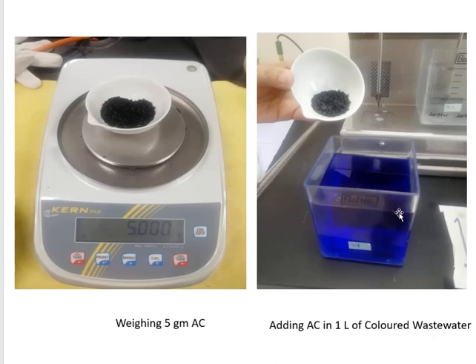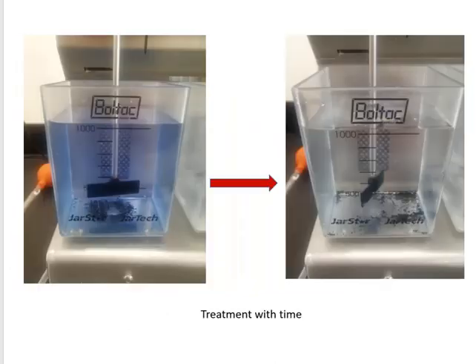We start mixing. Once the mixing is going on, you will see the color will reduce with time. The activated carbon is mixing with the solution from which we need to remove the color. And after some certain time, for example after 5 minutes, 10 minutes, you will collect the sample and you will see with time the color is decreasing. Ultimately you will see that all the color is removed. So this is the treatment with time you will see in this step.